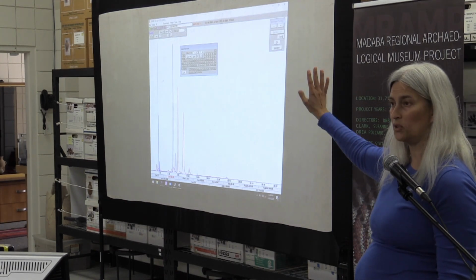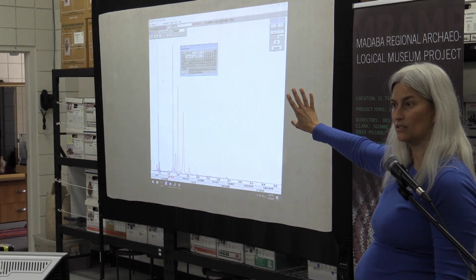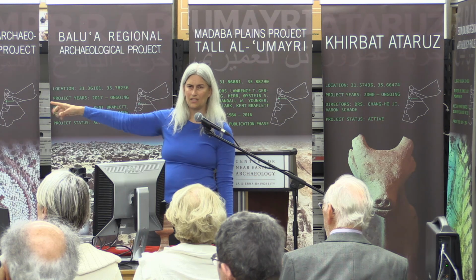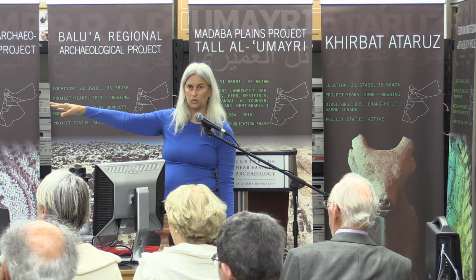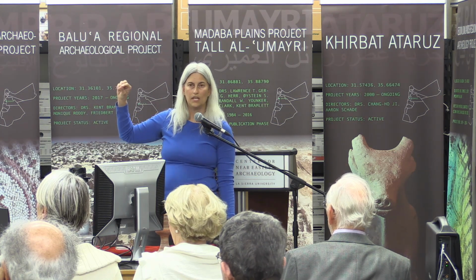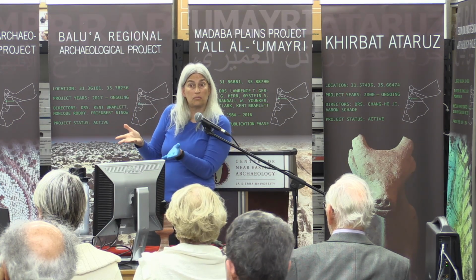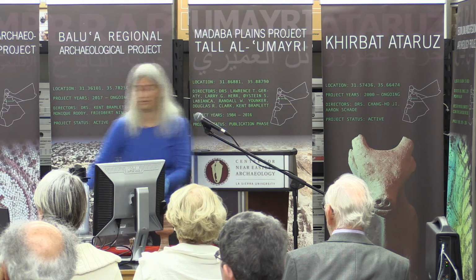Okay, so now I'm at palladium. Do we have palladium present? No, yeah, because we don't have a lot of peaks. We have some little tiny ones there, but we'll come back to those in a second. Okay, so I don't have palladium. Well, that's not a shocker. Those are gold color. We wouldn't expect palladium to be present.